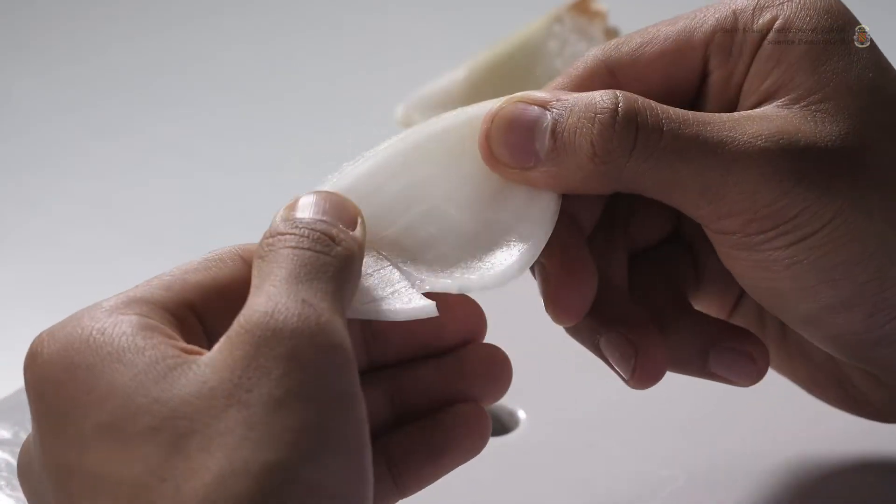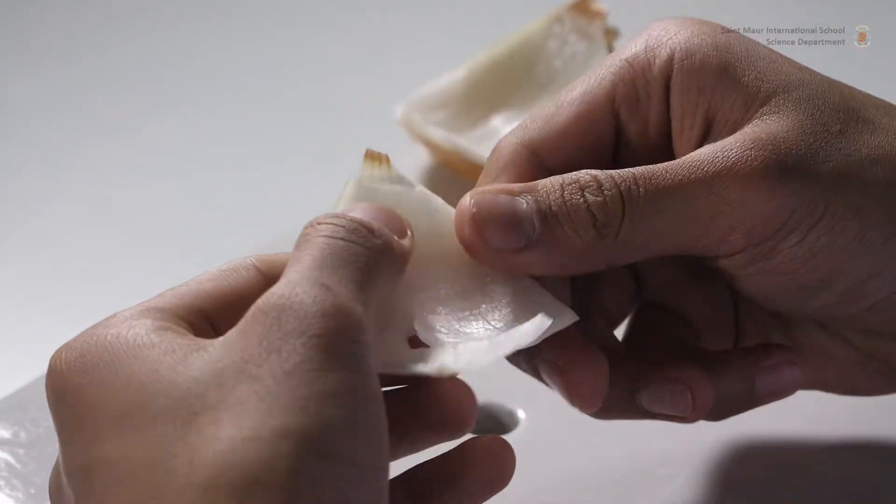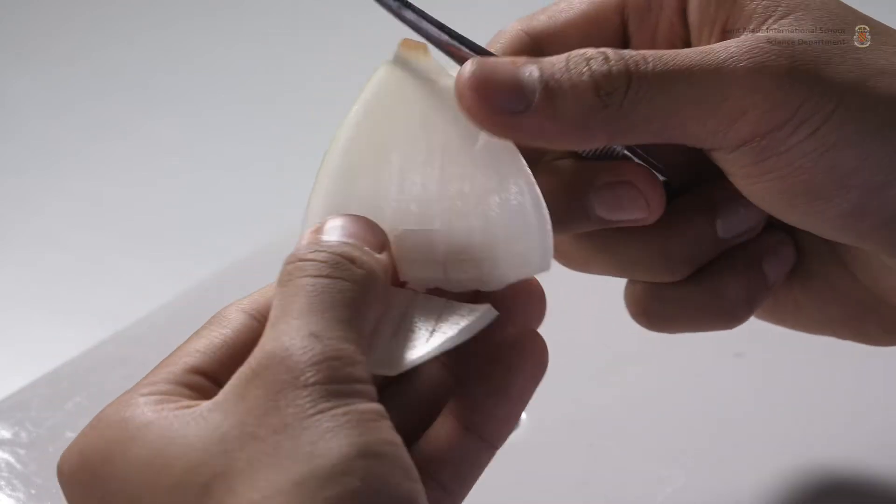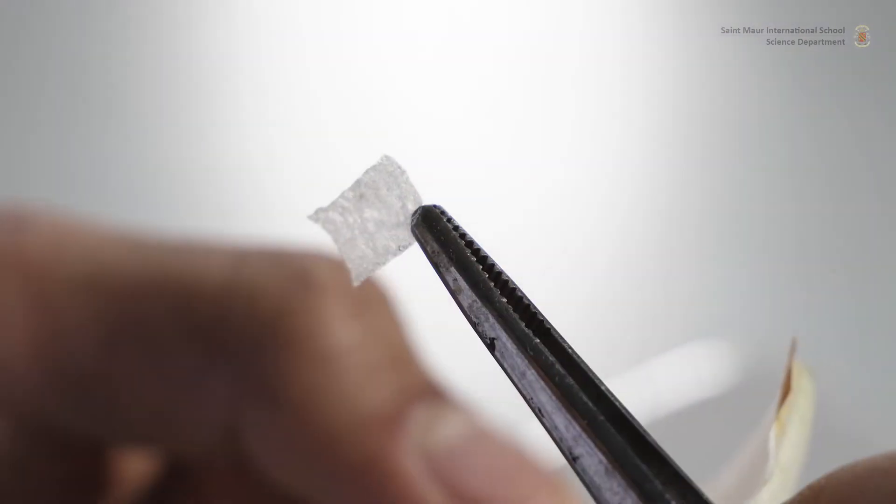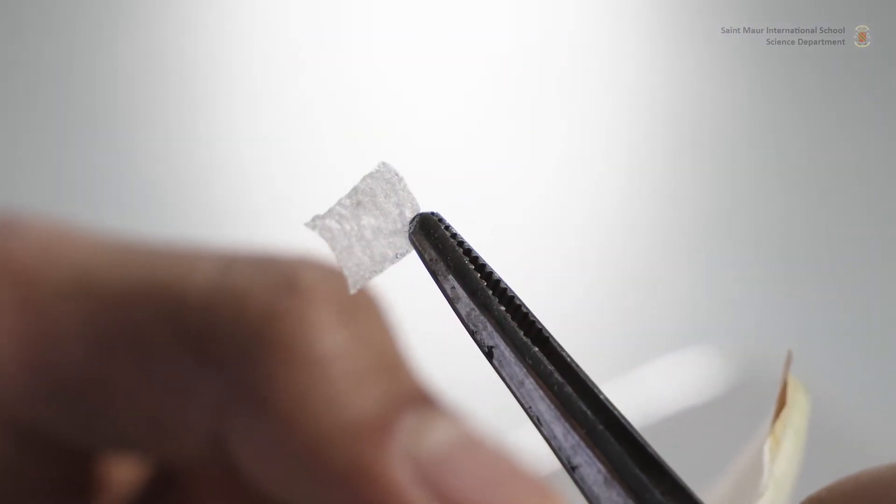Just before treatment, peel off an epidermal section, either using tweezers or your fingers. Make sure you do not peel off excessive fleshy tissue underneath as you lift the layer.